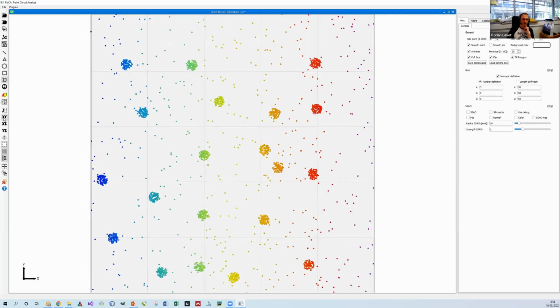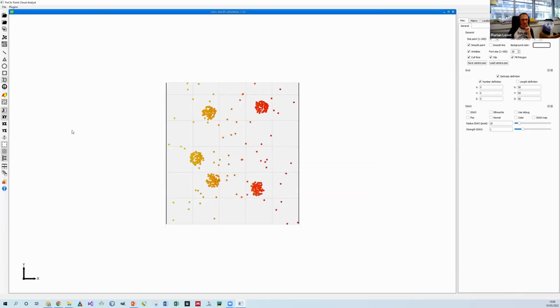You choose the frame, it will go directly to this rotation, and then you can select the cropping tool. Now with the mouse, you left click and stay clicked, and then you drag until you are happy, and you release the button.